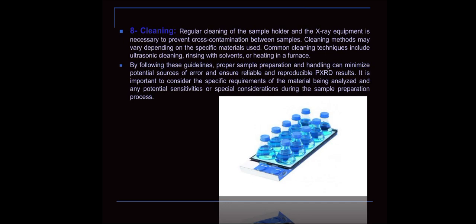Eighth one, cleaning. Regular cleaning of the sample holder and the X-ray equipment is necessary to prevent cross contamination between samples. Cleaning methods may vary depending on the specific materials used. Common cleaning techniques include ultrasonic cleaning, rinsing with solvents, or heating in a furnace.